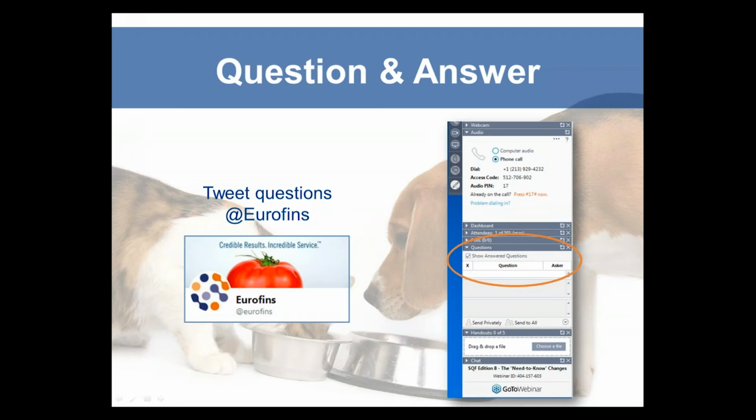So moisture, and it kind of depends on what methodology you're using, but moisture is the amount of actual water that's in a product. Now, if you're using a loss on drying type of method to analyze for moisture, depending on the ingredients in the product, there could be some other things classified as moisture, such as volatiles.